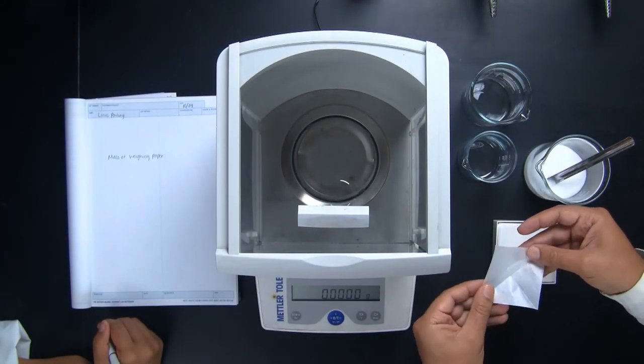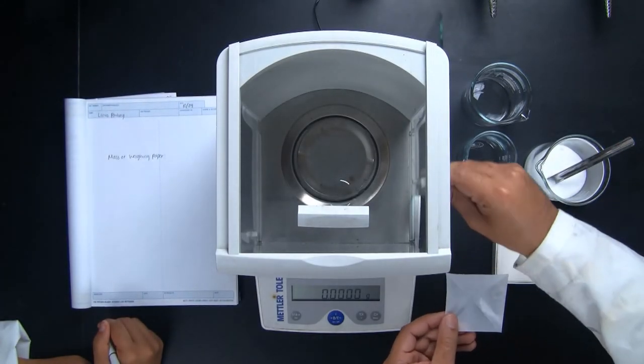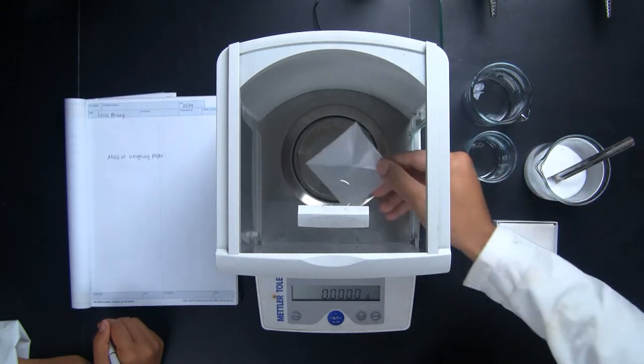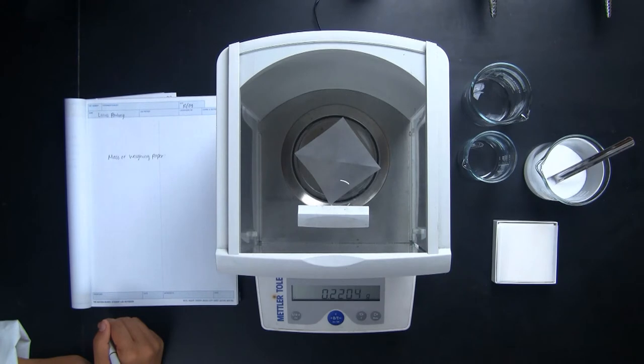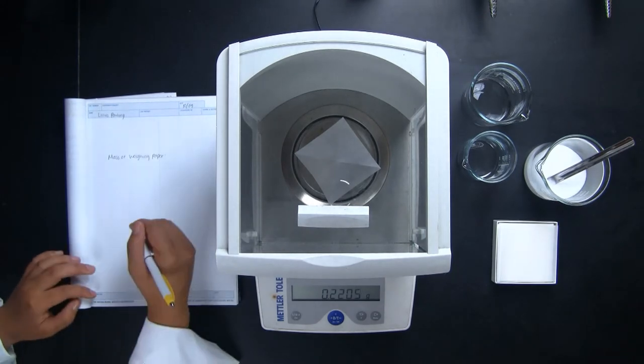To help the reagent stay on the weighing paper, Ash is carefully folding it twice, kind of like a taco, in order to create a pocket for the reagent to stay on the paper and make it easier to manipulate.